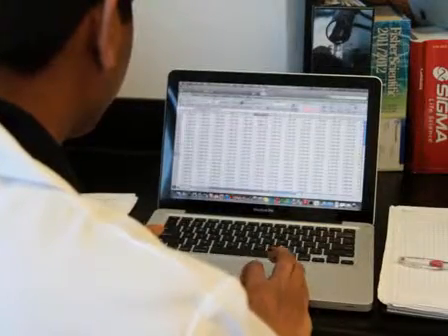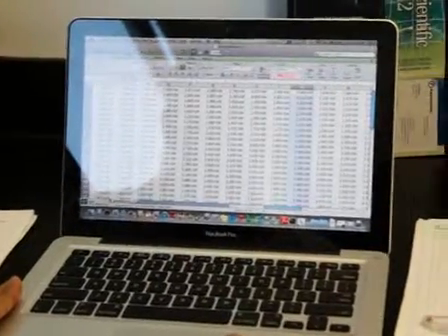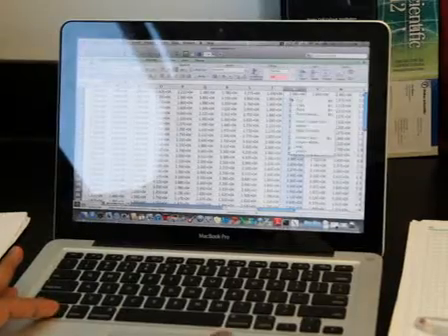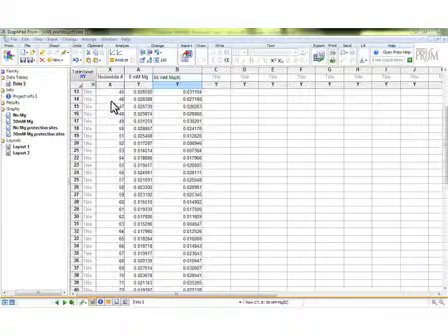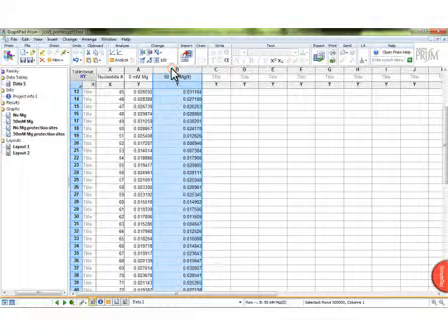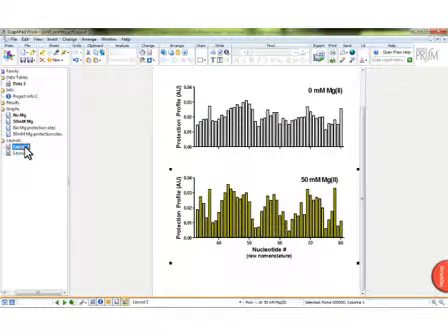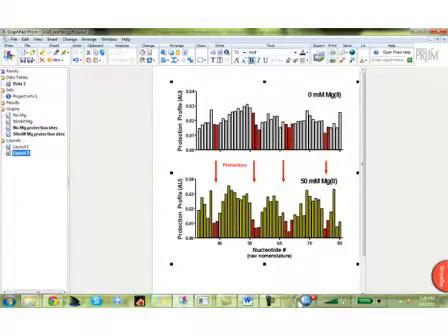Sapphire outputs a spreadsheet containing columns representing lanes on the gel and rows representing the individual band integrals corresponding to the RNA fragment. First, the protection sites that display a noticeable change in solvent accessibility have to be identified by comparing the protection profile derived from the no magnesium ion sample to the profile of the endpoint magnesium ion concentration. The lower the value, the more protected the nucleotide is against attack from the hydroxyl radicals and vice versa.